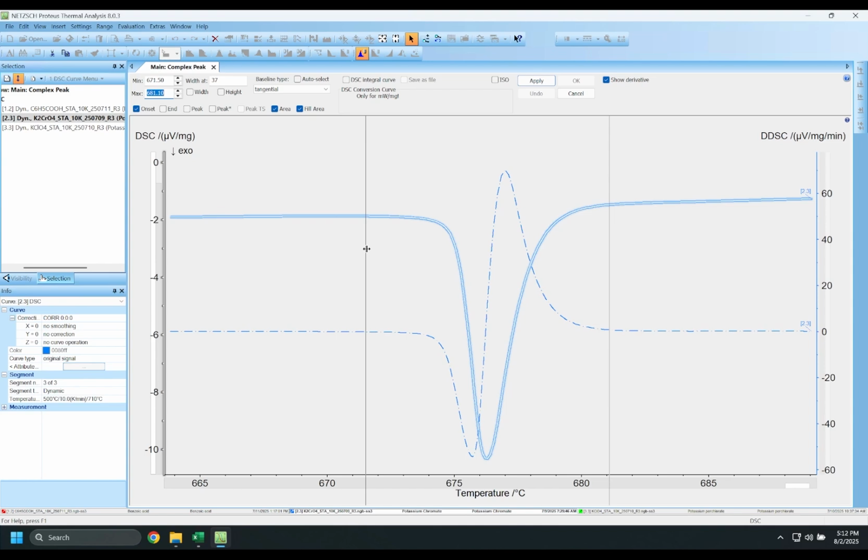In terms of actually selecting the region of temperatures, you will want the left region to be just before any type of onset and the right region to be just after the transition is completed. In this case, we'll look at when this curve starts to dip below what we would consider would happen without the transition occurring, and when it's reached a stable state and is constant. There's a couple different baselines you may want to choose, and I'll show you what they look like.